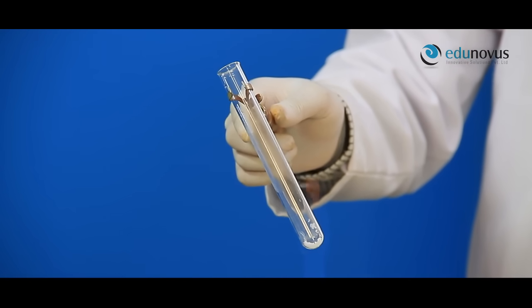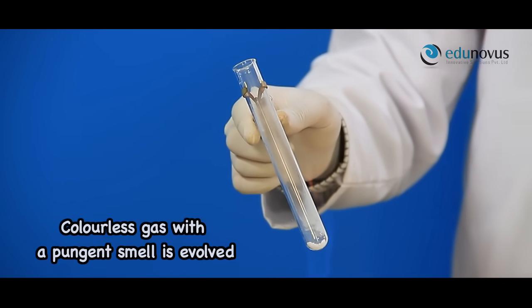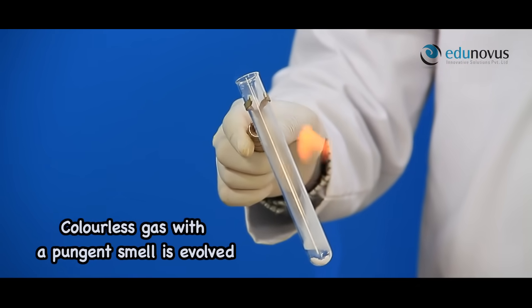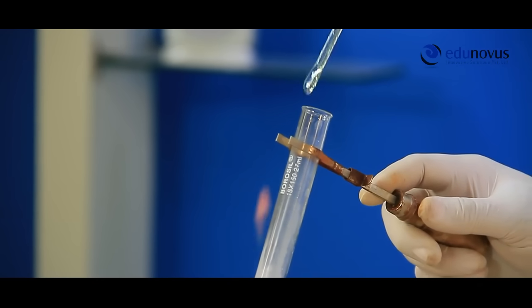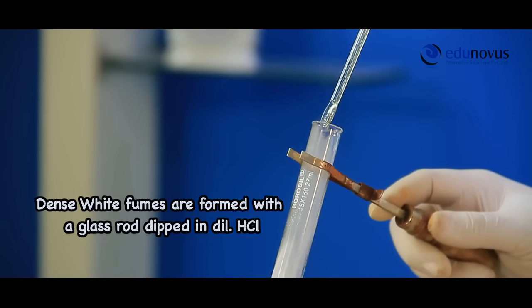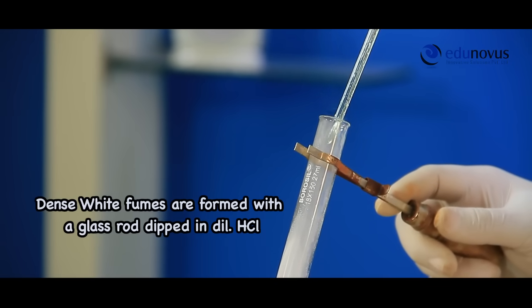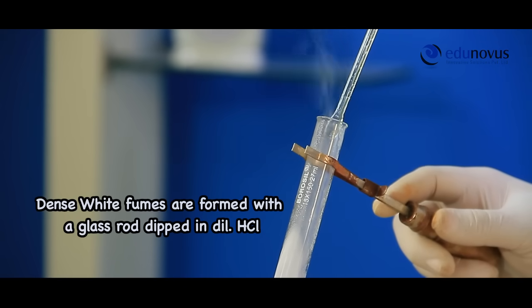If a colorless gas with pungent smell gives white fumes with glass rod dipped in dilute HCl, it infers the presence of ammonium cation in the given salt. Here you can see the formation of white fumes with glass rod. This test infers that the given salt may contain ammonium cation.